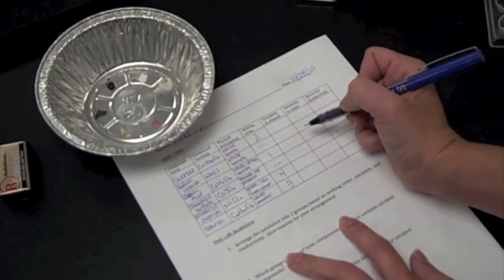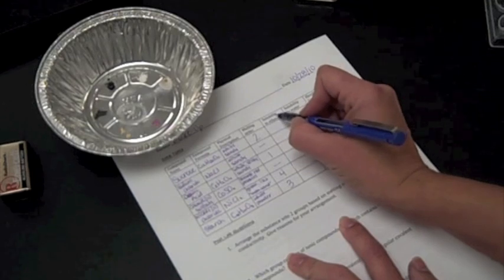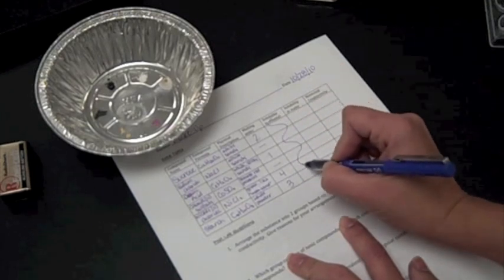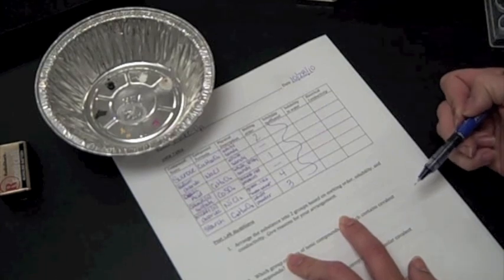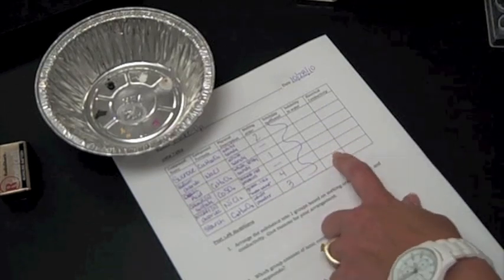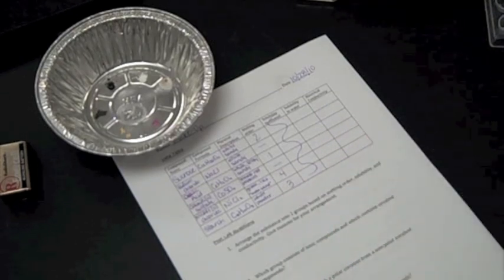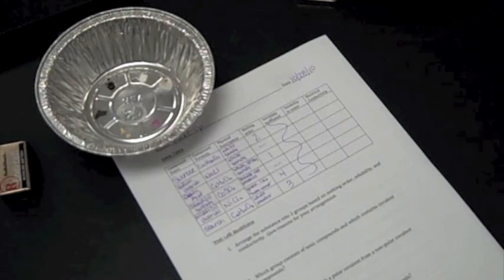Now for the solubility in ethanol part, we're actually going to omit that part. Don't you love it when you omit things? And we're going to go straight to the solubility in water just really to save time. And because this is the one that we need to test our electrical conductivity. So the solubility in water is what's next.